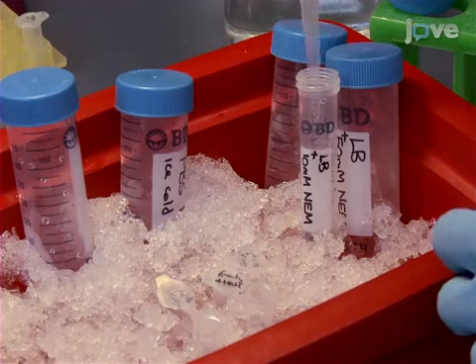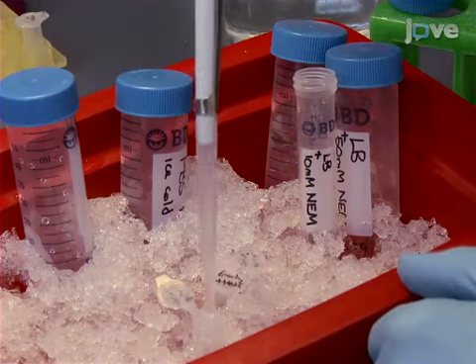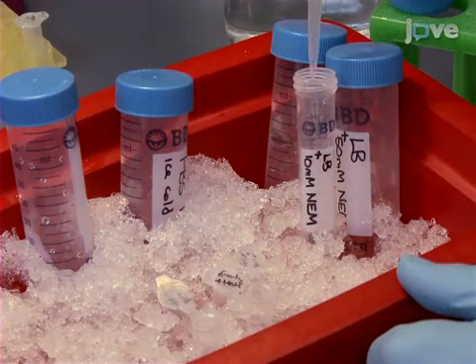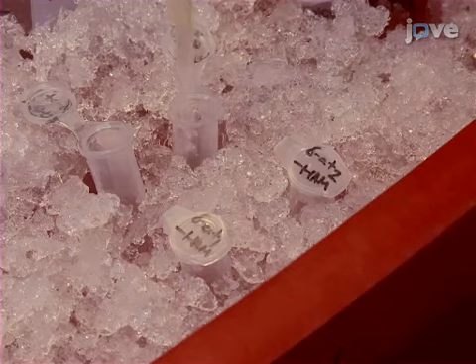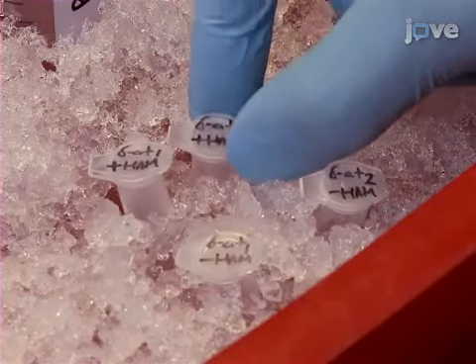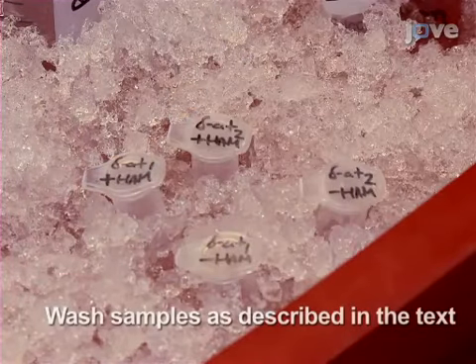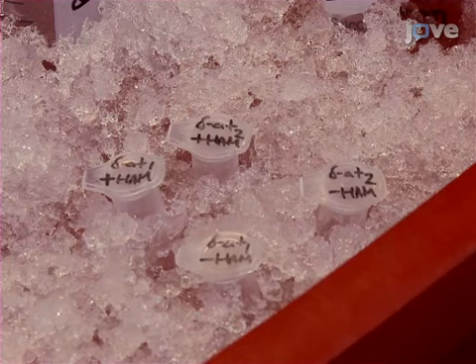Add an additional 300 microliters of lysis buffer plus 10 millimolar NEM to the -HAM sample. Pipette an additional 100 microliters to the +HAM sample for a total of 500 microliters in each sample. Incubate the tubes for 10 minutes on ice and then proceed to wash the -HAM and +HAM samples as described in the written procedure.